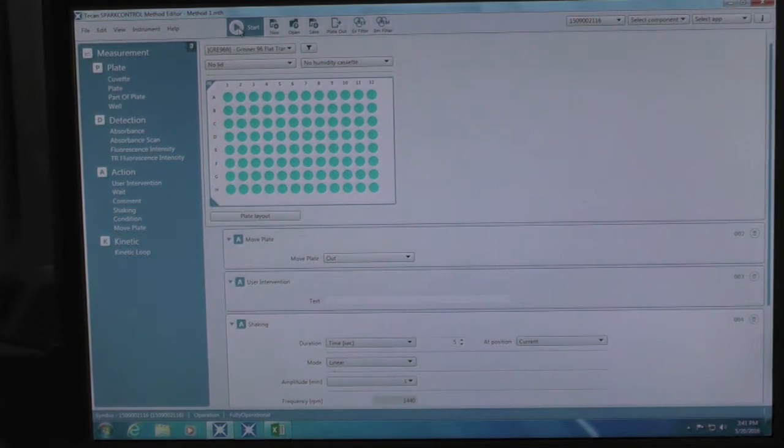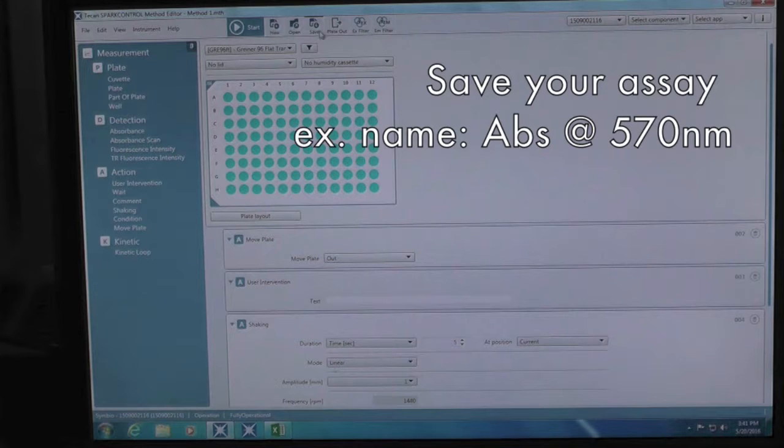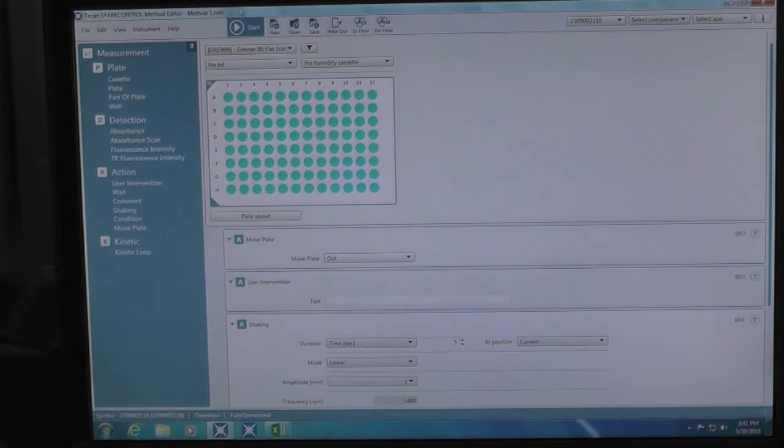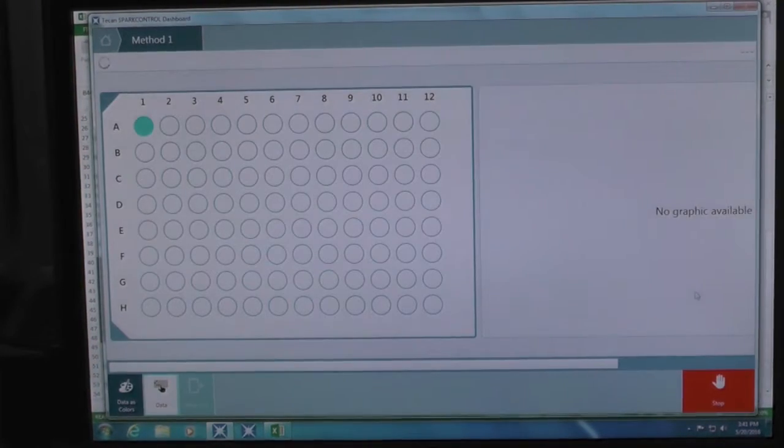Once you finish programming your method, save the method under a descriptive title. In this case, absorbance at 570 nanometers. After you save your method, click start and your method will begin.